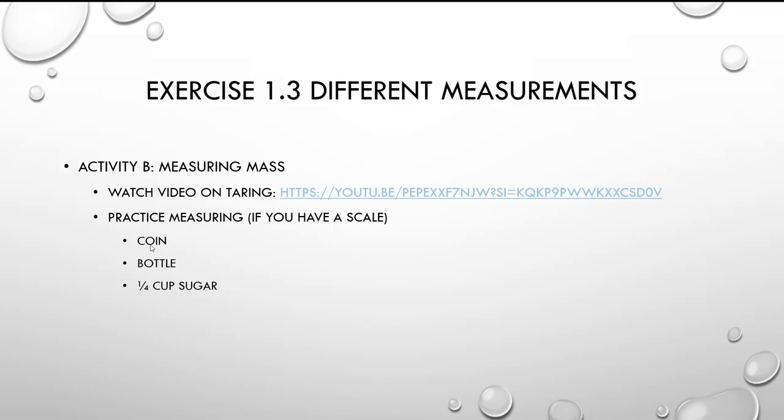And even those kitchen scales at home, you can convert the unit to grams, okay? So you can measure it in grams. For the sugar, obviously you're not going to dump a 1/4 cup of sugar onto your scale. So what do you do? You need to tare it.